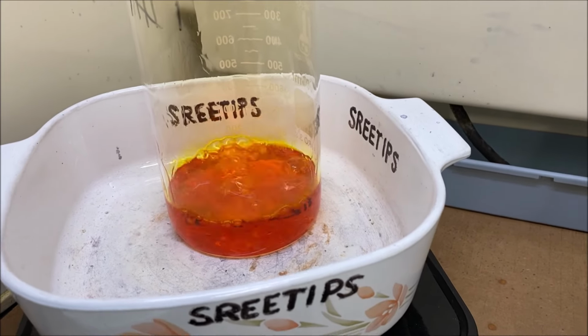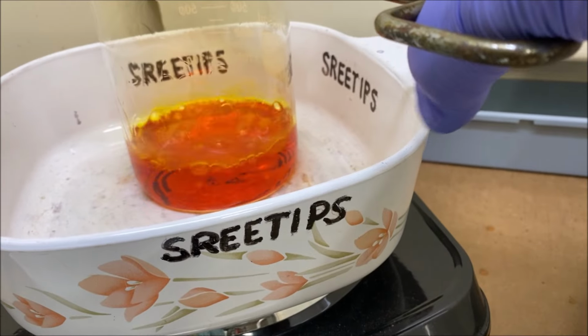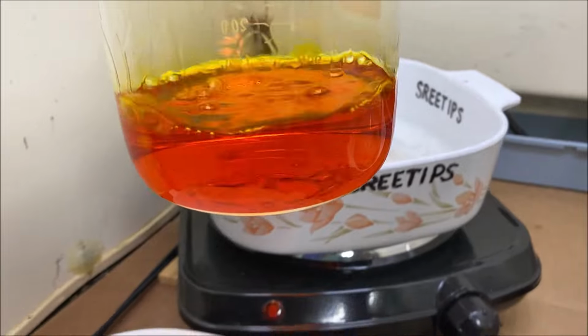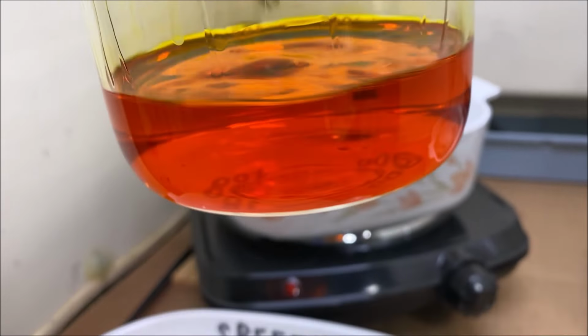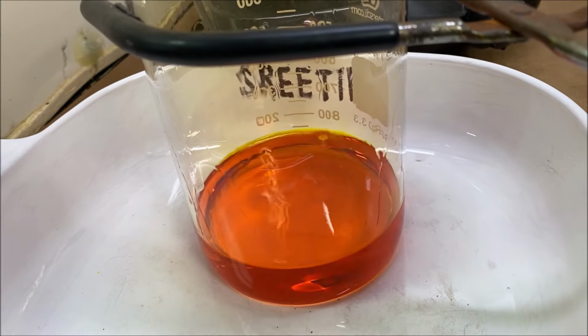That only took about 10 minutes. Got everything to go into solution now. I love that dark orange color of our gold chloride solution. Pull it down, let it cool off a little bit here.